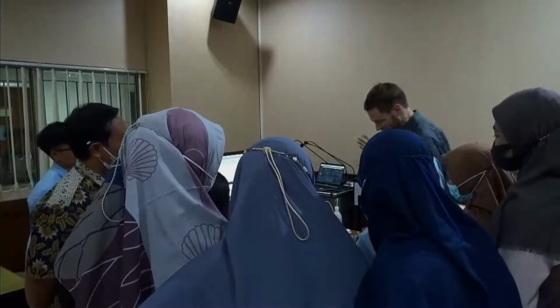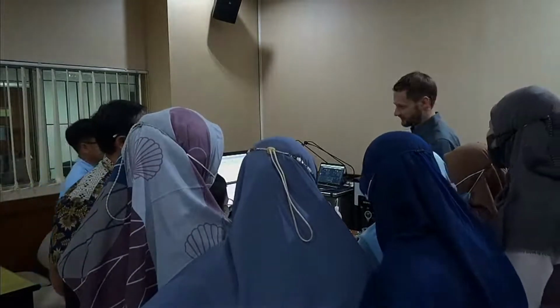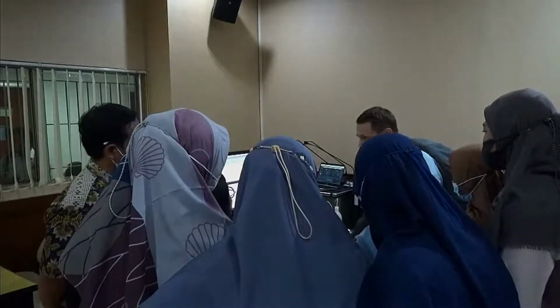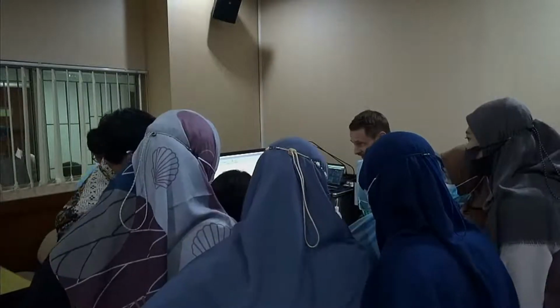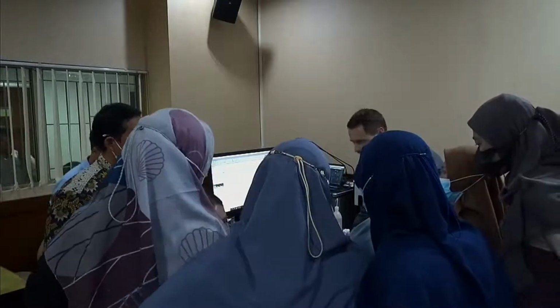I'm happy, it's our money, but yeah, for a customer, I think it's not the best way to do this. So what we do to measure our F500: we go to a new measurement and we select the SOP, which I have altered a little bit in order to be able to manually fill this.